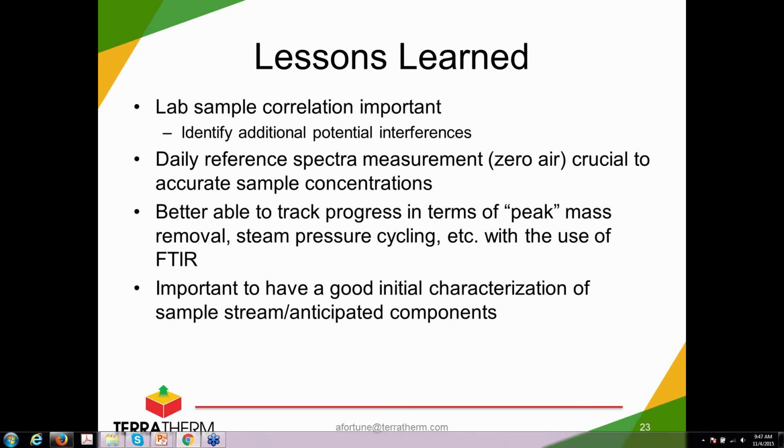One of the other main things would be to optimize something like carbon system usage. So we'd be able to monitor the concentrations in the vapor going into and going through those carbon beds to predict when we're going to get breakthrough, to optimize loading up of that first bed, so that we're not just responding to an exceedance and changing out all the vapor carbon.